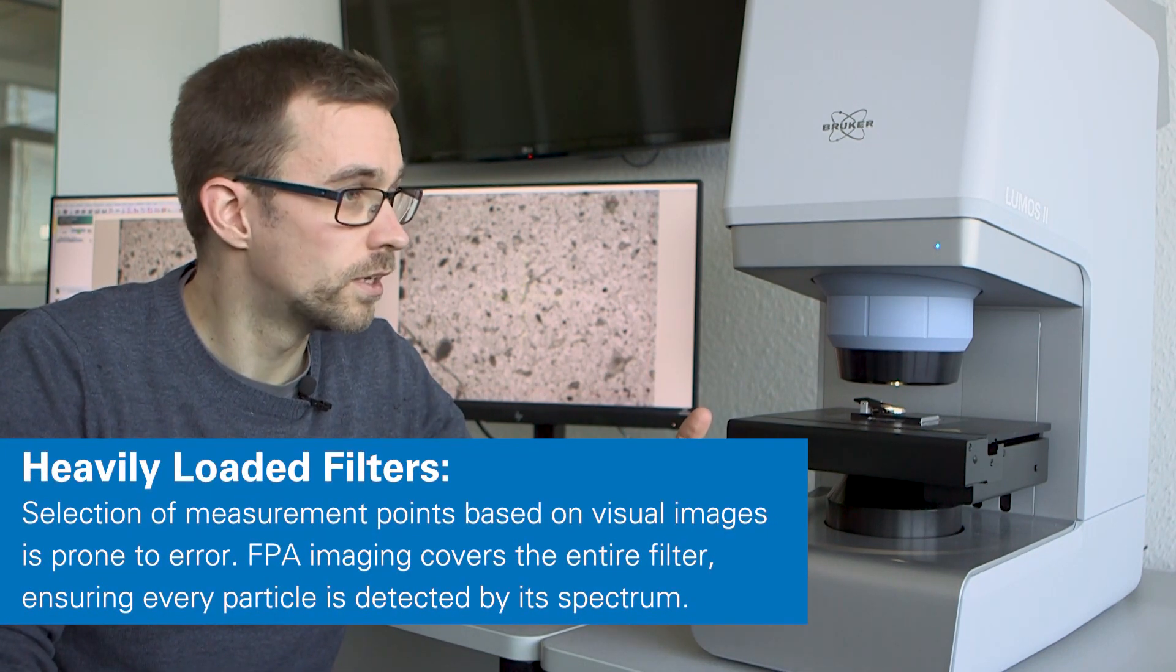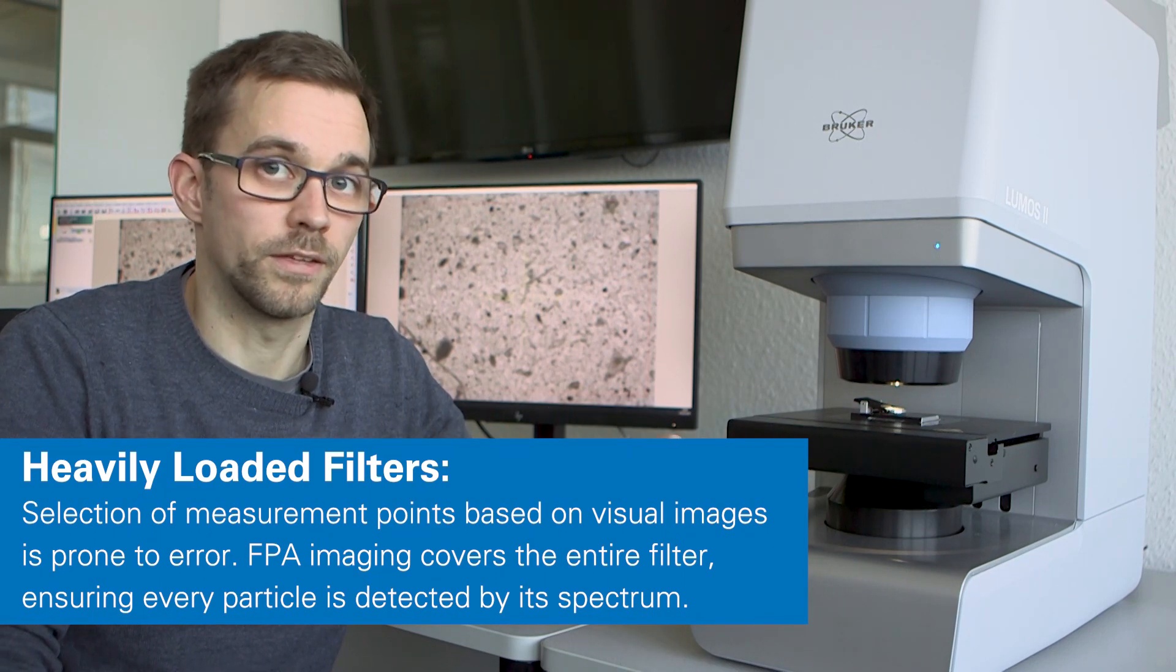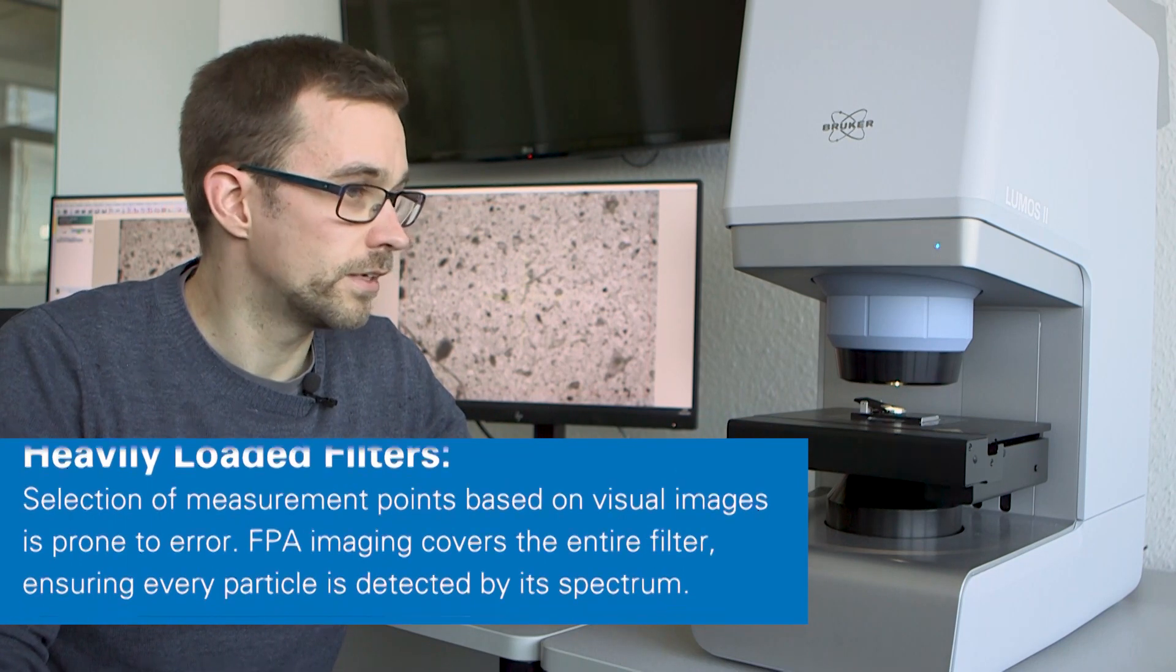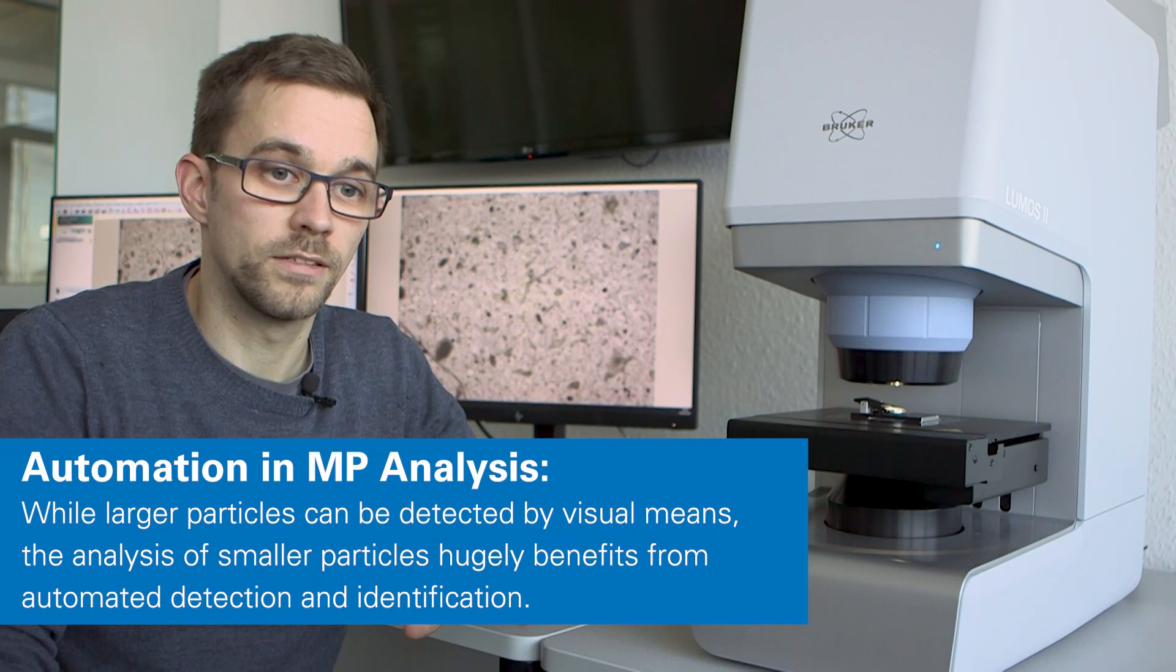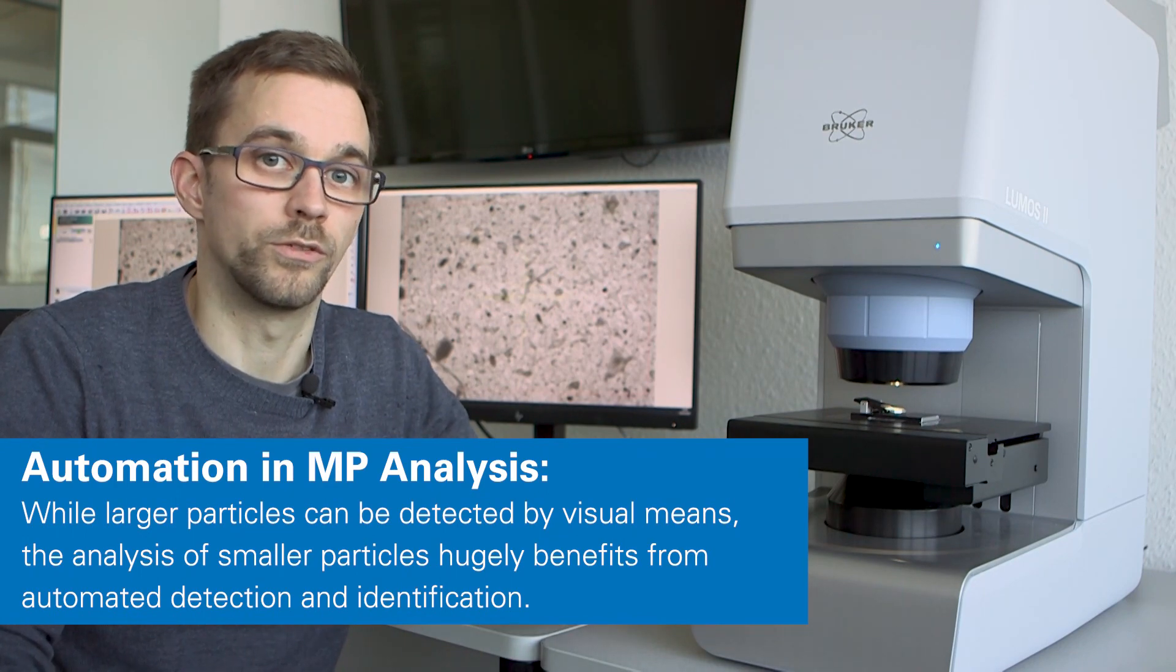So by measuring everything at once, we're not going to miss anything that might be on there and in the end the analysis is also automated and this way we can reduce the human error.